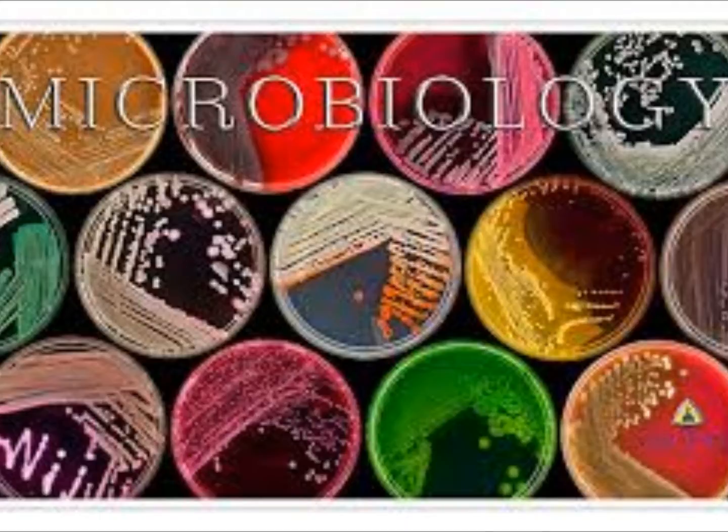Did I not have those organisms? Yeah, growth in all three. Have an extra one. You can put it here and show us. It's definitely not pink, though I see a little bit of pink in there. Then you can show them how you would do it.